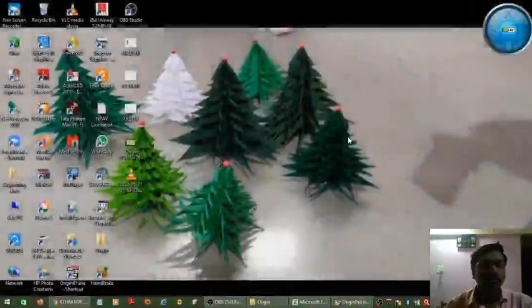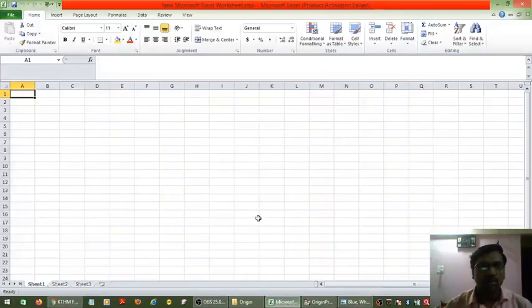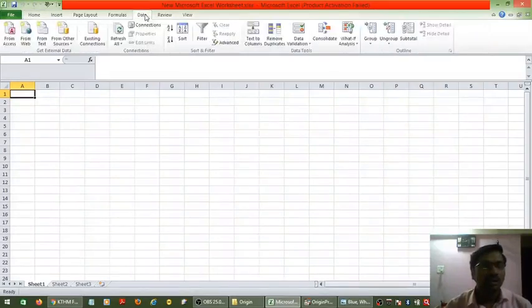So you just go to the Microsoft Excel worksheet. In that we have Data. Click on that.